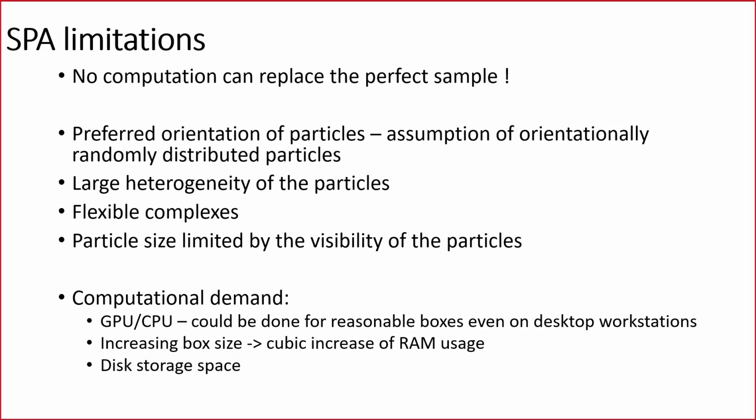The last thing, computational demand. Nowadays, all the software is optimized for CPUs or graphics cards, GPU accelerators. I would say that cryo-EM is even doable on some personal workstations to a certain extent if you have reasonable box sizes.